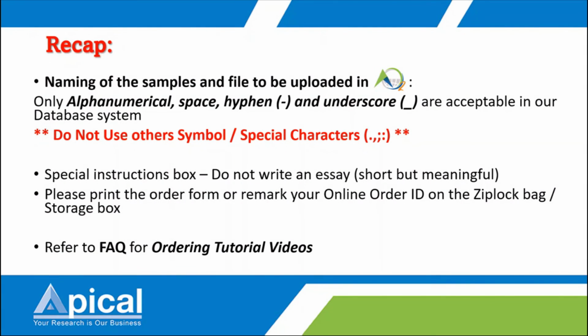So if you have lab mates or anyone actively submitting orders through the old system, maybe you can pass the information to them as well. One thing I would advise is to start using the AO2 now, so that if there are any issues, we can help you troubleshoot. The common issues are mainly on the Excel form.